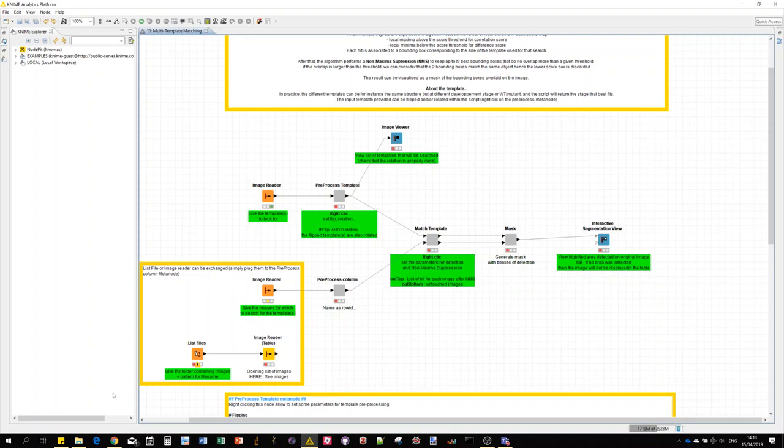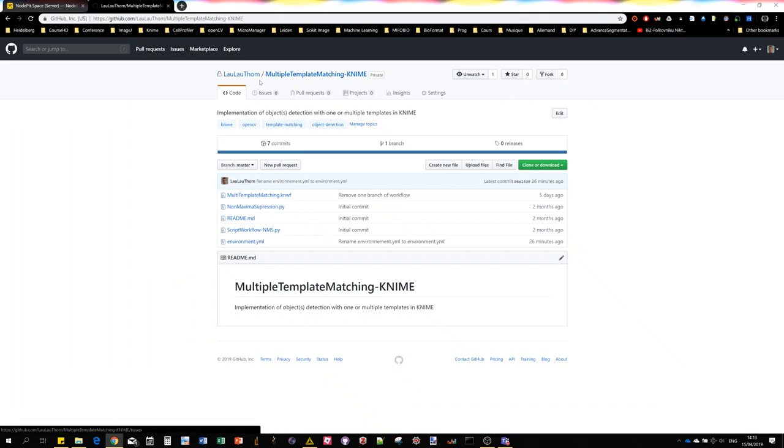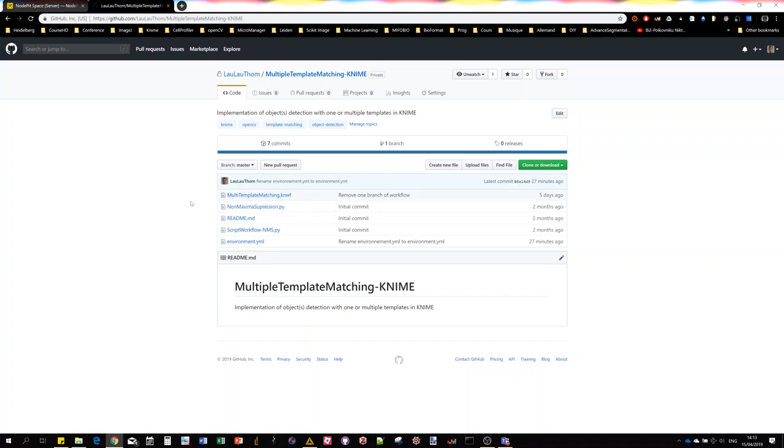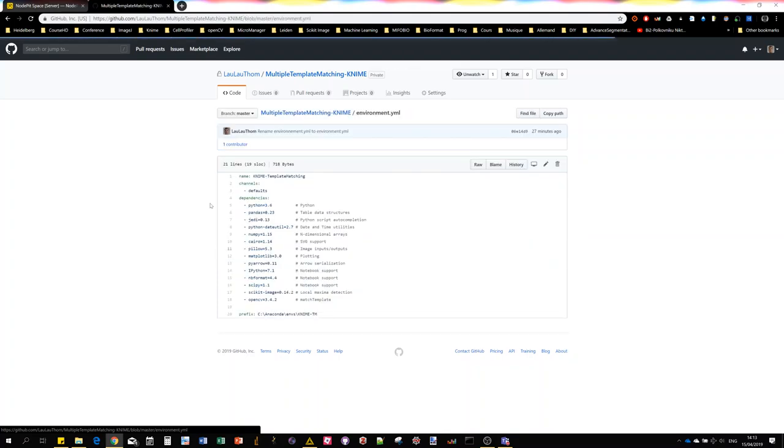Then for the Python environment you can refer to the instructions available on the GitHub repository, which is this one here, which will be soon public. There are a number of files in this repository. The first one is the workflow file itself which will open in KNIME directly.